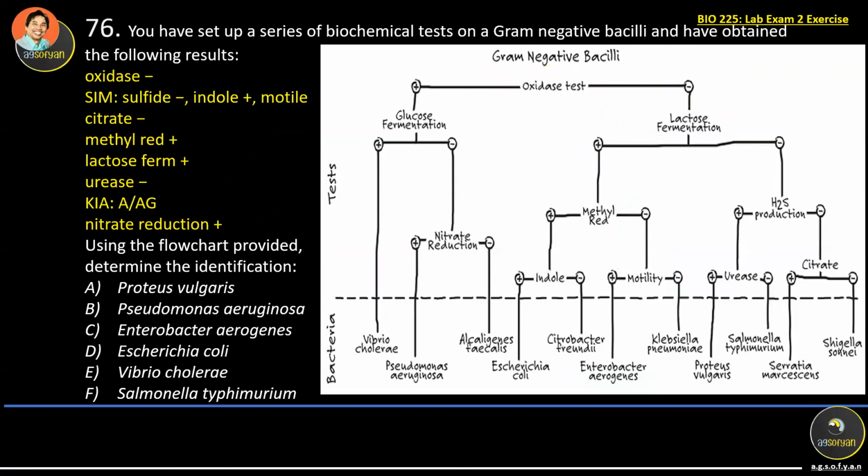Okay, we're going to perform the same thing. Of course, it is oxidase negative. So look at the oxidase negative, which is this. And then what after that? Lactose fermentation. Look for that one. Oh, it's positive. Then you go positive.